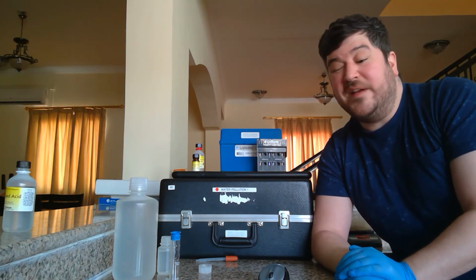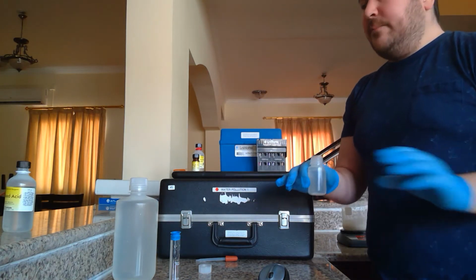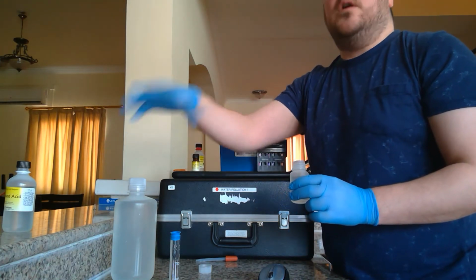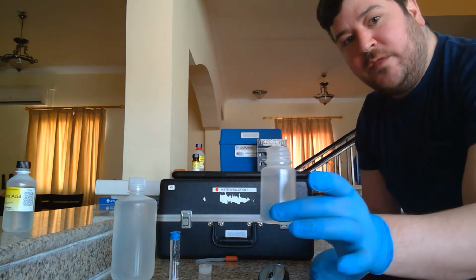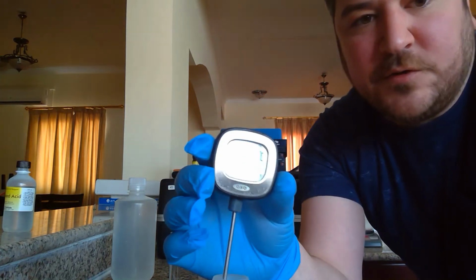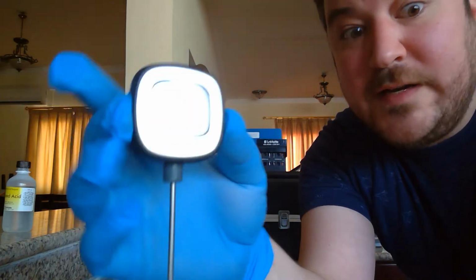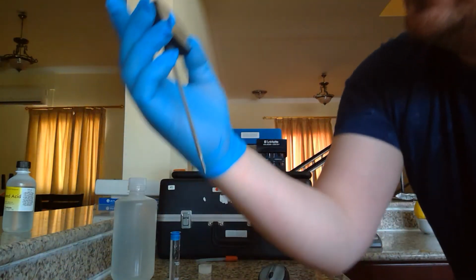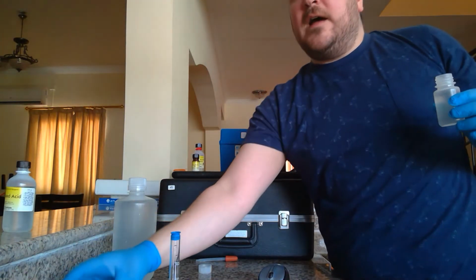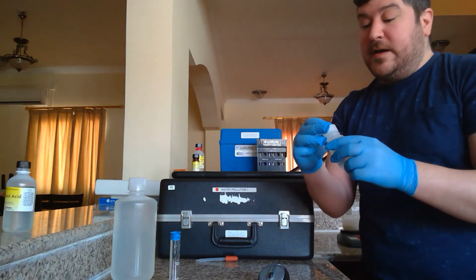The other thing it says in the introduction is the best results are obtained when the solution temperatures are 23 degrees Celsius. So before I go any further, it'd be nice to check the temperature. This water has been sitting here for hours, so it's reached kind of room temperature. This is another little sample bottle I have, again at room temperature, and I'll just test the temperature of this. According to this, we are at 23.8. So we are pretty much on the dot for the temperature range, close to 23. It doesn't get much better than that.